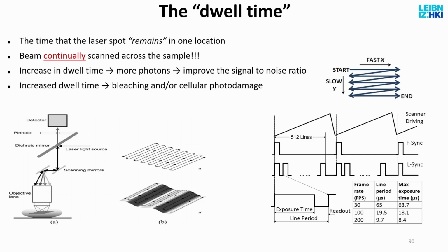That's how it calculates. Because you say I want 1,000 pixels, it says, okay, then your optimal pixel time, or before it dwell time, so how long the laser would dwell at this certain moment, should be 1.2 microseconds.